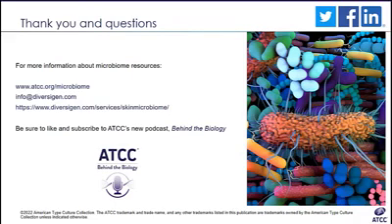So we've already had quite a few questions come in. Let's go ahead and start with the first. So Tasha, what are the advantages and disadvantages of sequencing certain regions of the 16S gene versus shotgun sequencing versus full-length 16S sequencing for skin microbiome analysis?